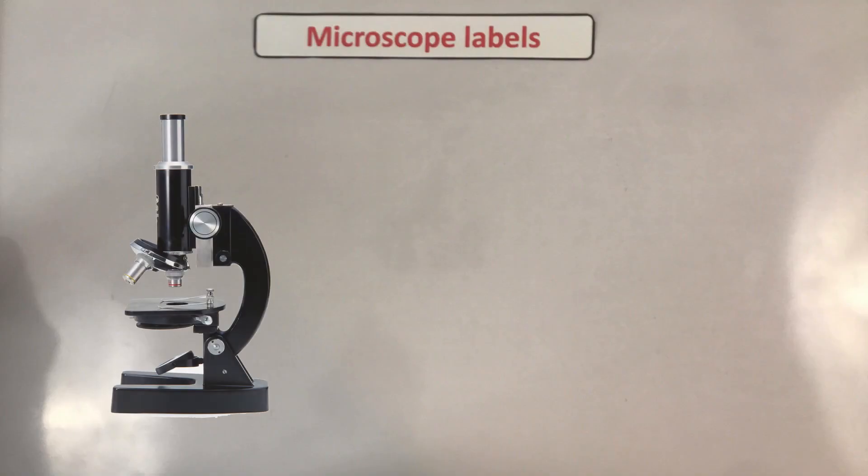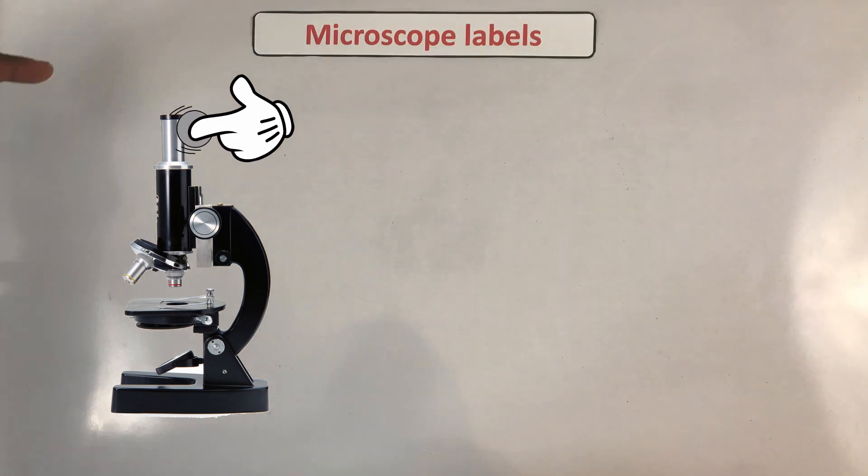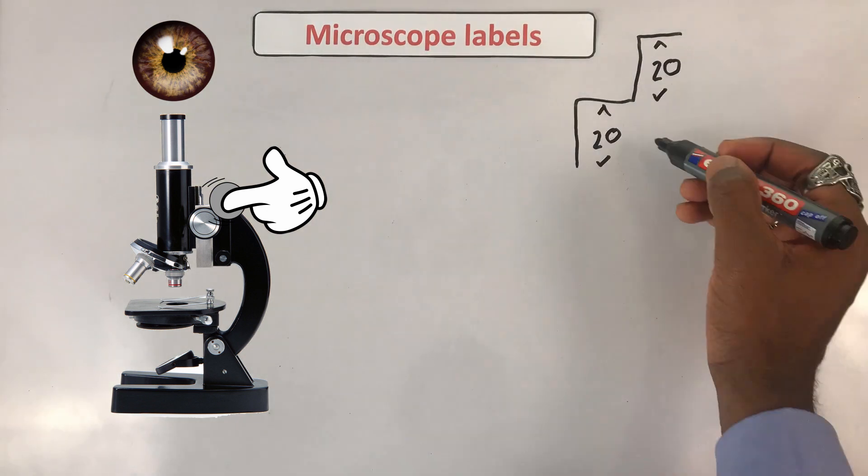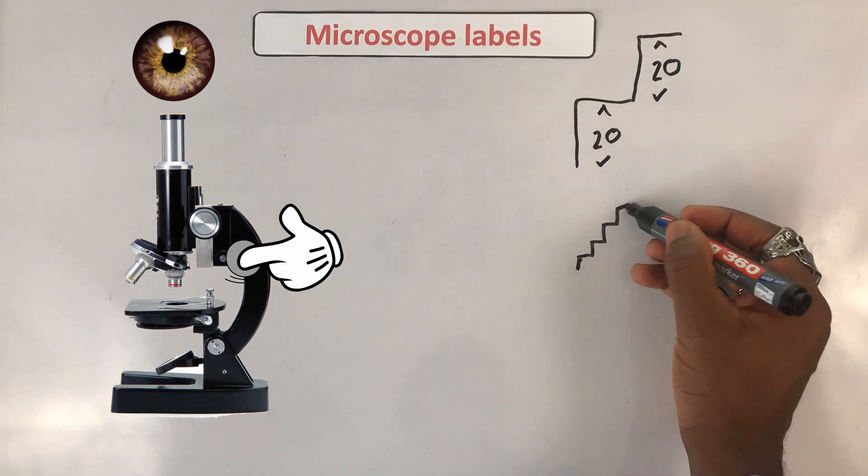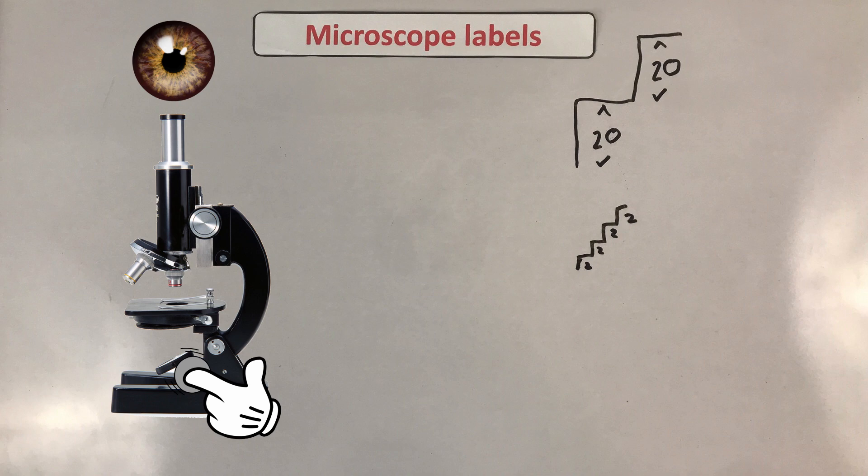Here's a typical light microscope. You need to be able to label this. Going clockwise, you've got the eyepiece. This is where you pre your sample. The lens in here is ×10. Then you have your coarse focusing wheel. This helps you focus in big steps. Then you have your fine focusing wheel. This helps you focus finely in smaller steps. Underneath you've got your light or your mirror. This allows light to pass through your object into your eye.